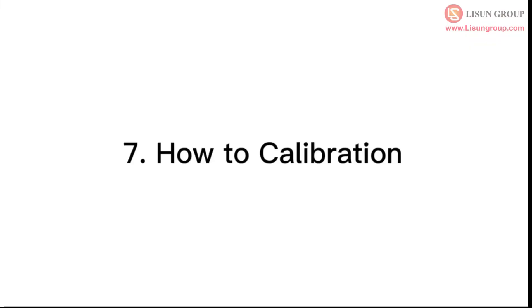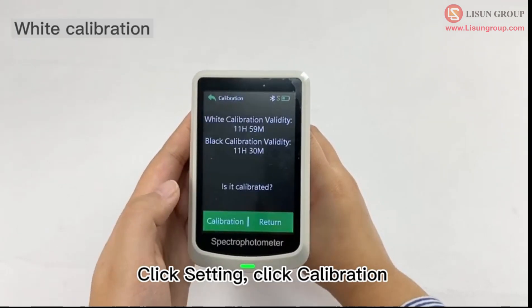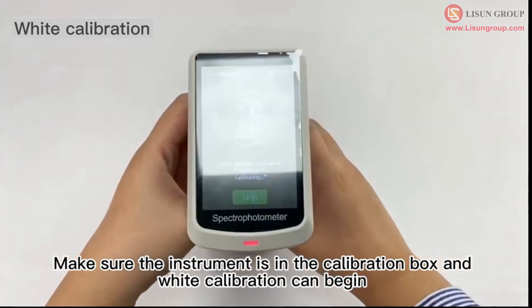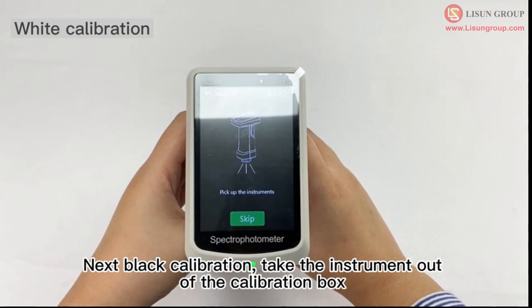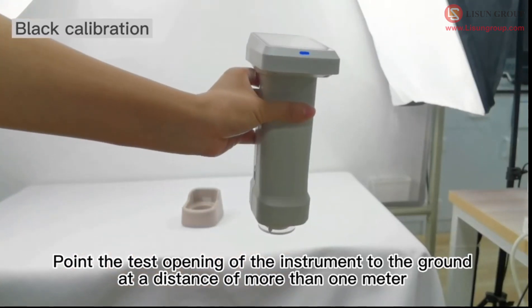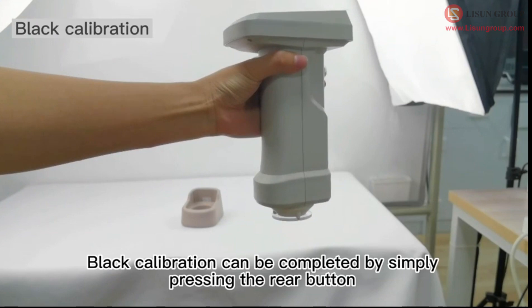How to calibrate. Click setting, then click calibration. Make sure the instrument is in the calibration box and white calibration can begin. Next, black calibration: take the instrument out of the calibration box and point the test opening to the ground at a distance of more than 1 meter. Black calibration can be completed by simply pressing the rear button.